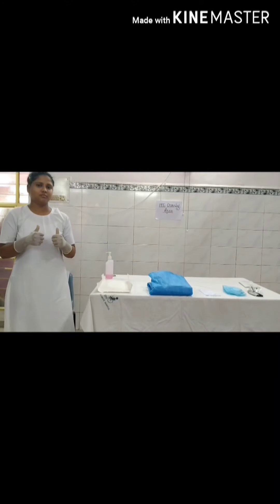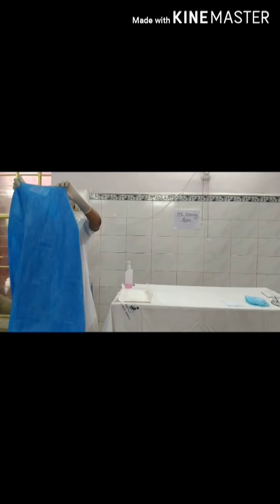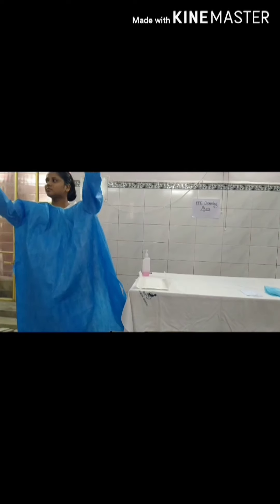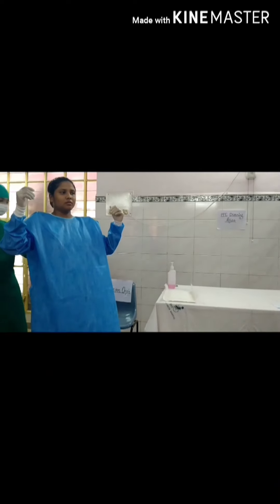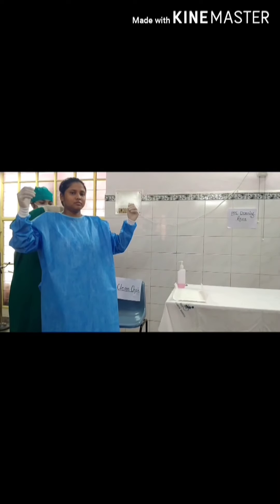Wear the gown. The gown should be worn in such a manner that the arm sleeves of the gown cover the gloves at the wrist. For tying the knots, a companion may help. You may need assistance so that you can tie the rear knot.